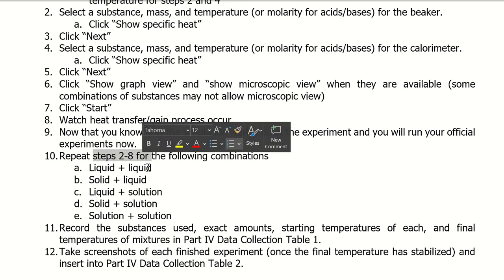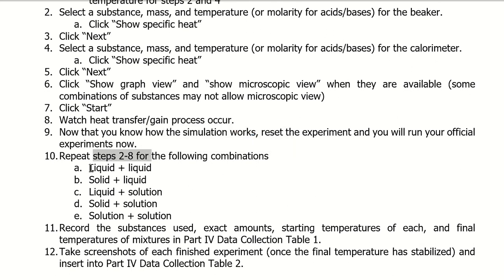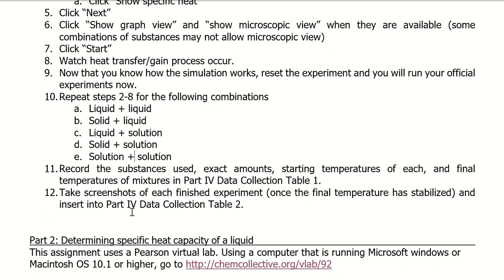And you're going to repeat these steps for the following combination. So you're going to choose a liquid and a liquid, a solid and a liquid, liquid solution, and you get the point, right? You're going to choose all these different combinations. You should be able to choose all of them. If you can't for some reason, just let me know and we'll figure it out.